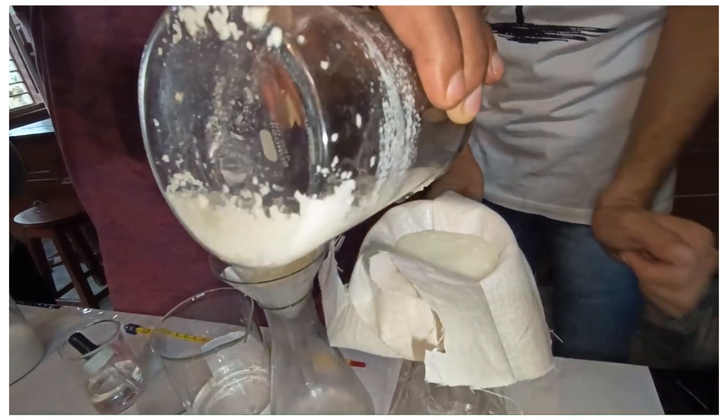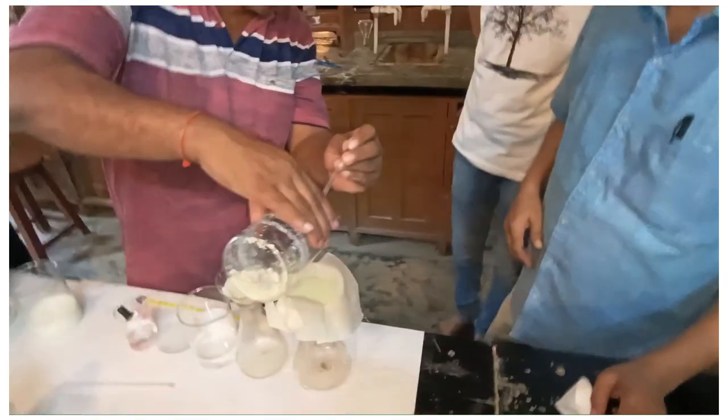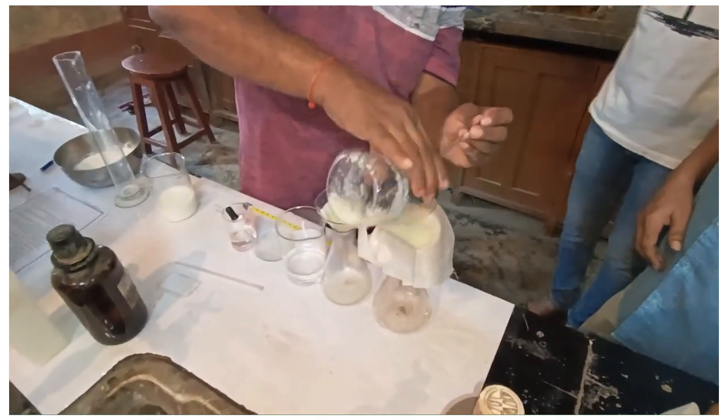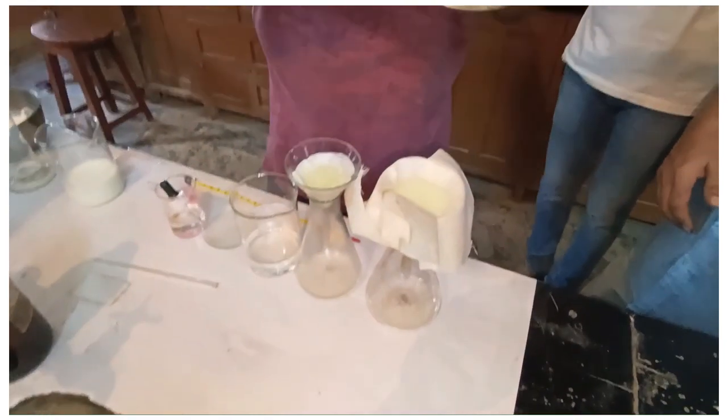All the casein that you collected after the addition of acetic acid, so much, too much. Great. So much amount. This is a good one.